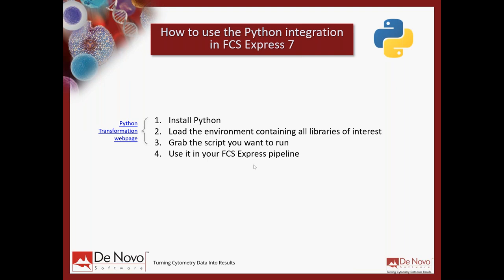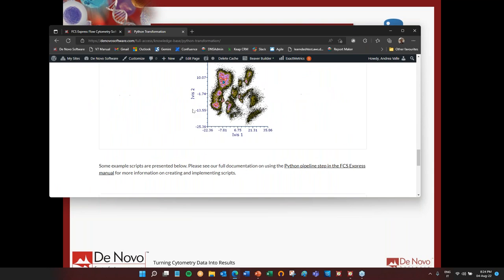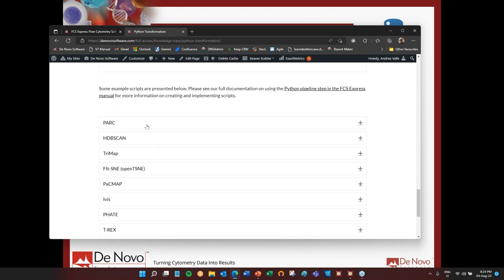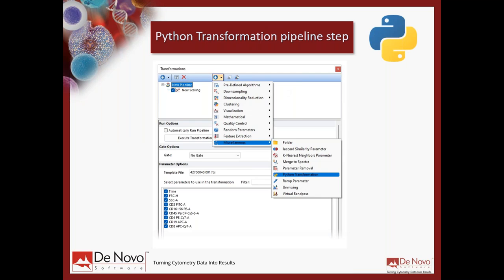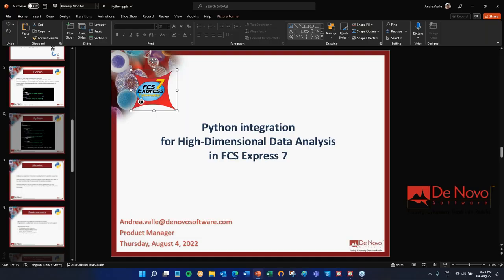Now that you know where to grab information, let's go back and see how to do it practically. After installing Python and loading the environment you can download from our website, you grab the script you want to run. First, after installing Python and the environment, we need to open FCS Express, create some plots and gates, create the pipeline, and add some preprocessing steps before adding the Python transformation. Let me close and do it in real time.